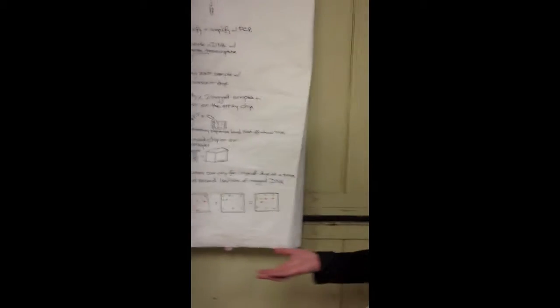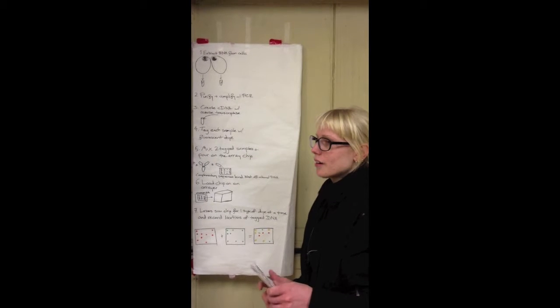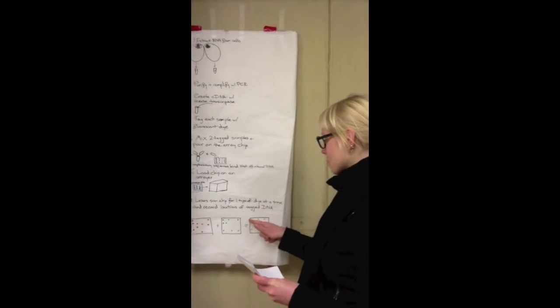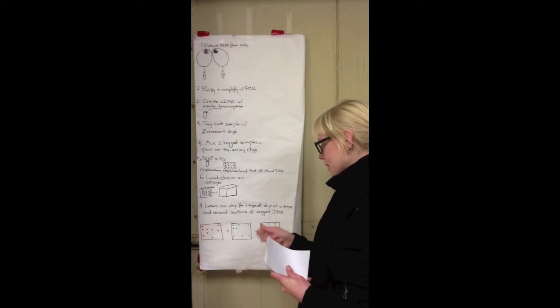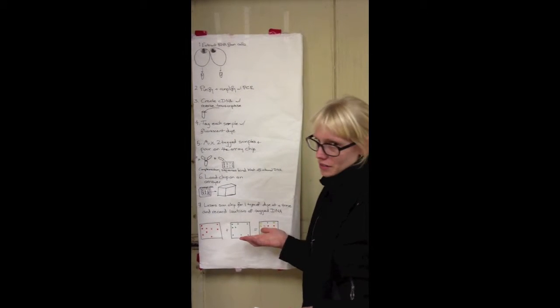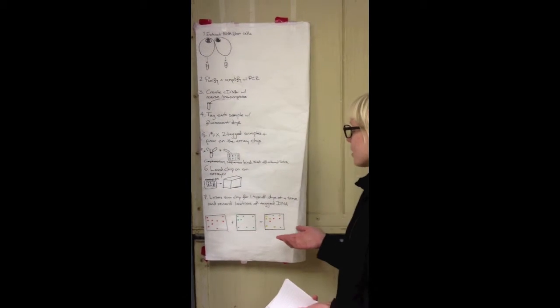So how do we interpret these results? Well, there are four different results. Each individual spot is its own DNA fragment, and it could be black. You might see nothing here. That means that neither sample expressed the gene.